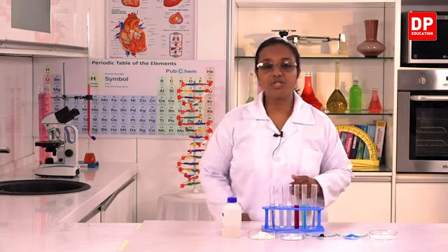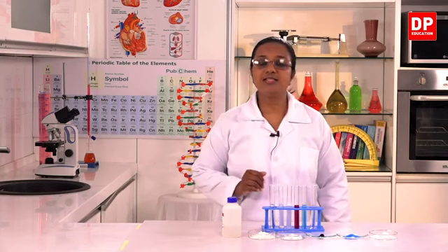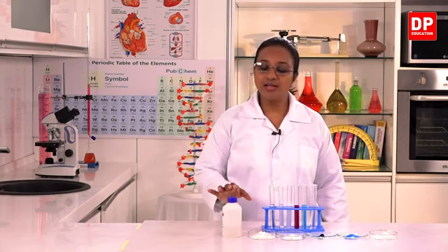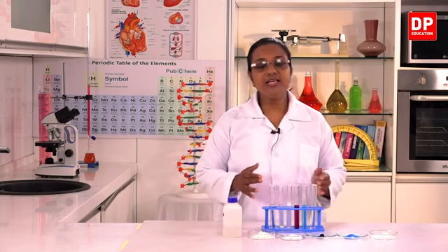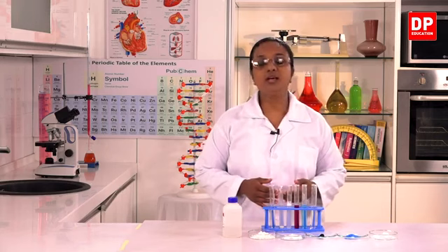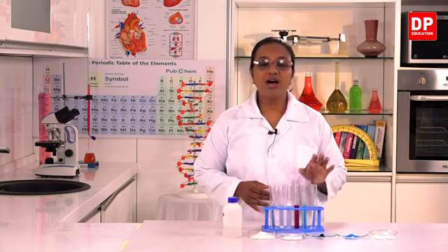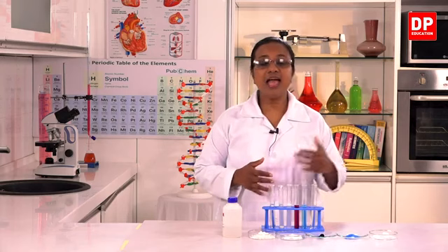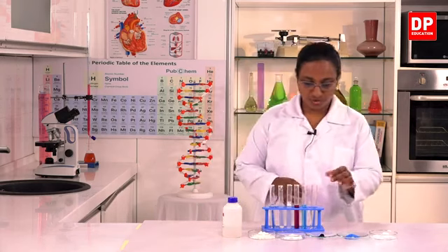Then we have the washing powder and flour. These are substances that are used at home. Then we have the colorless liquid, that is ethyl alcohol. Now, I have already dissolved all these substances in equal amounts of water. Here you have to observe how the solution is. Look at the transparency and the color of the solution. So, let me show you.